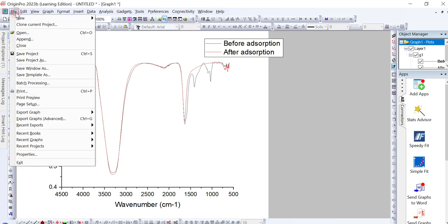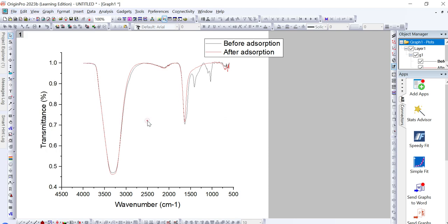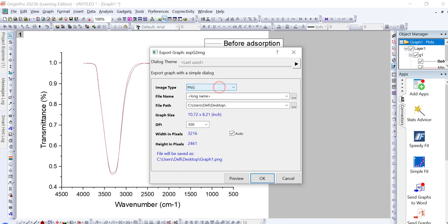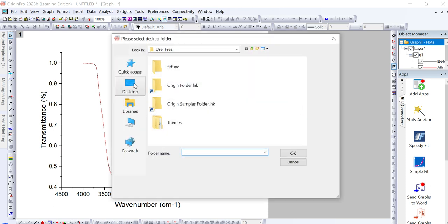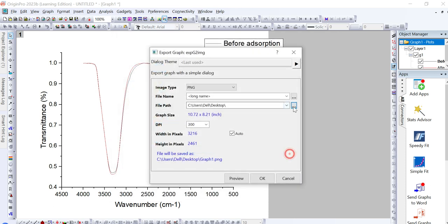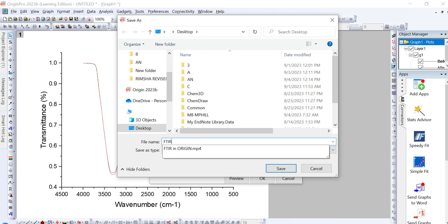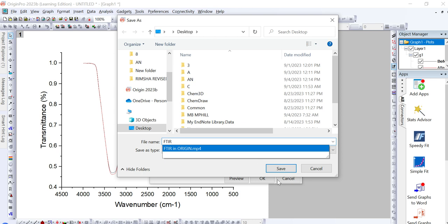To save the FTIR graph as a PNG file, click on File, then Export Graph to open the dialog box. Here you can select the image type — PNG, JPG, or any other format — and choose where to save it. For example, click on Desktop by clicking the three dots, then set your file name, for example 'FTIR'.